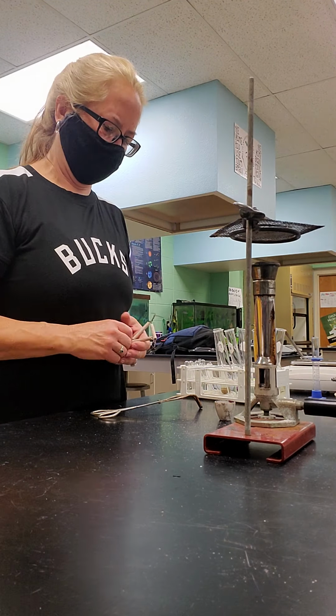And the magnesium in hydrochloric acid bubbled, gave off a gas. So that's, once again, showing you that the product of the reaction, the chemical reaction, is different from the properties of the original substance. All right, next, we are going to burn some sugar.